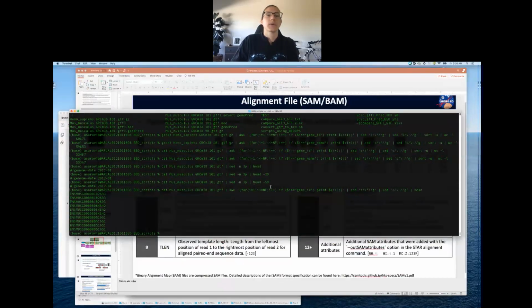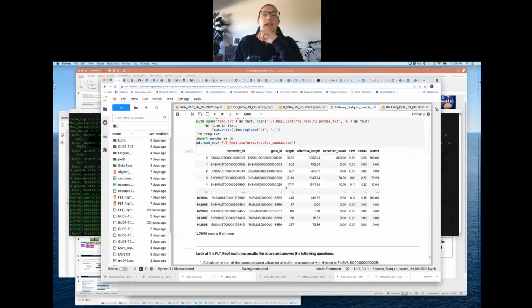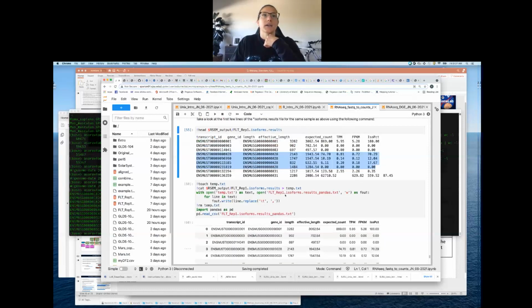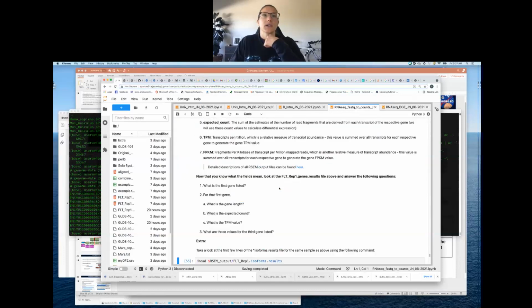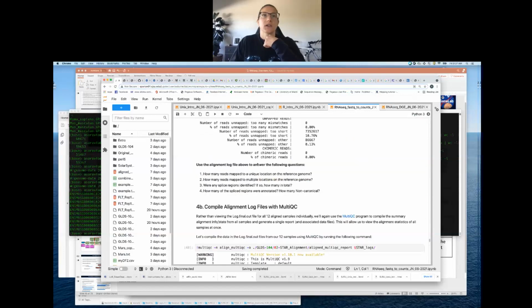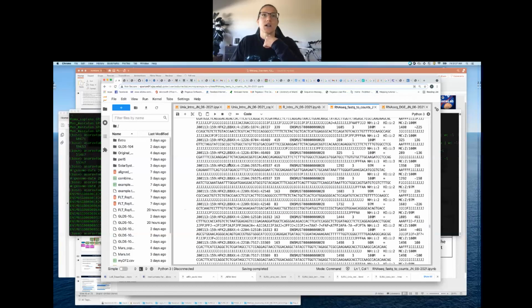So remember when we were taking a look at, let me bring up my notebook. Remember when we were taking a look at the total number of IDs, Ensembl gene IDs, and it was over 55,000? And we kind of looked at the total number of lines in our GTF file. The population here. Somewhere.